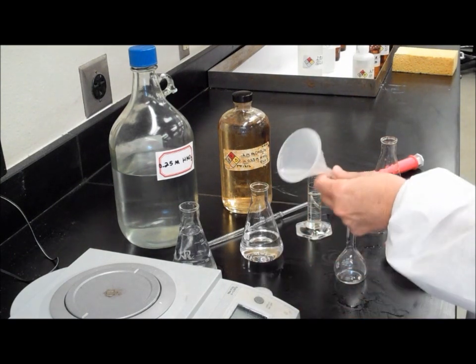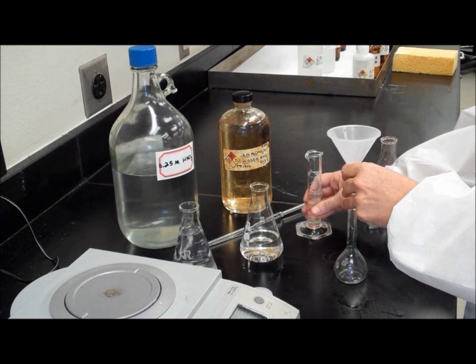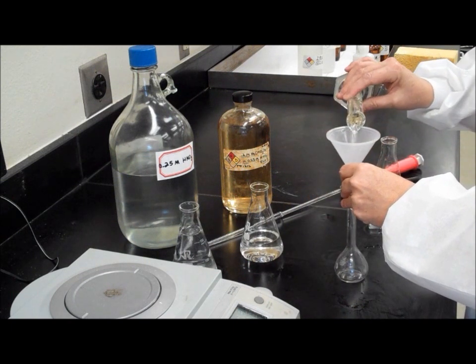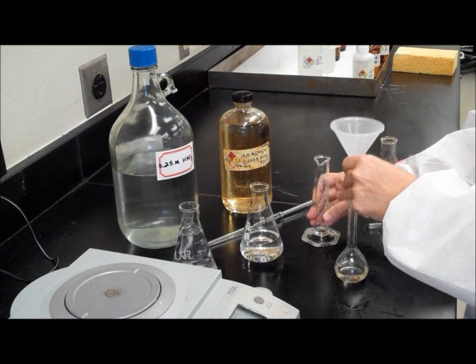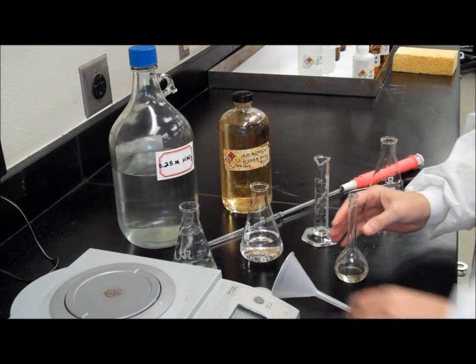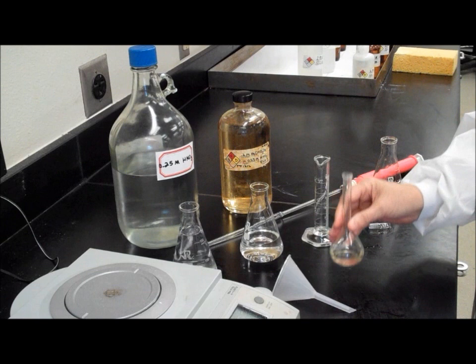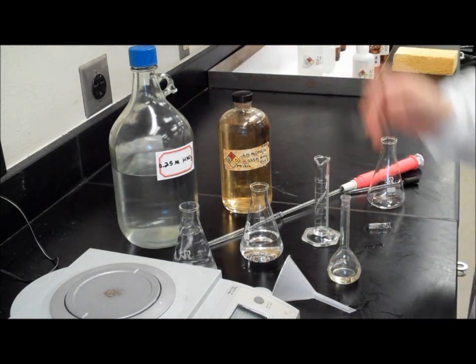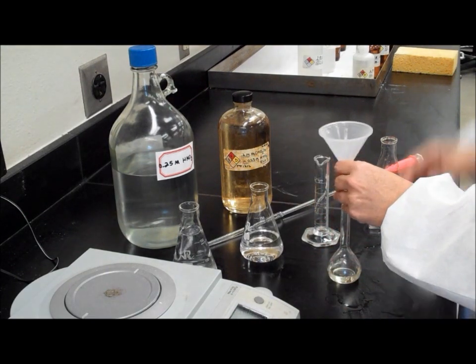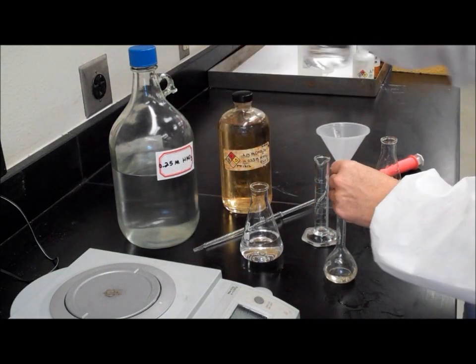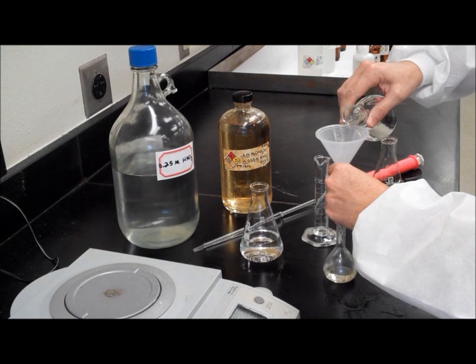Using a funnel, add your iron nitrate to your volumetric flask. You will then need to dilute the solution to 50 milliliters using 0.25 molar nitric acid. Using the funnel, fill the body of your volumetric flask with your nitric acid.